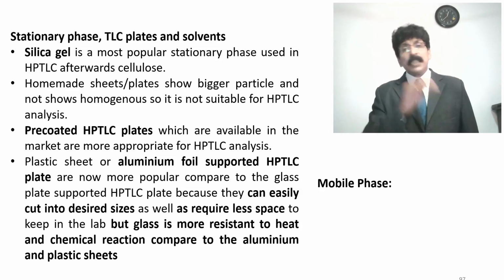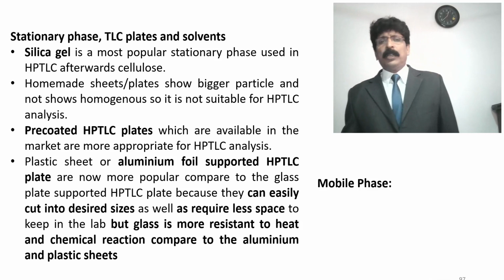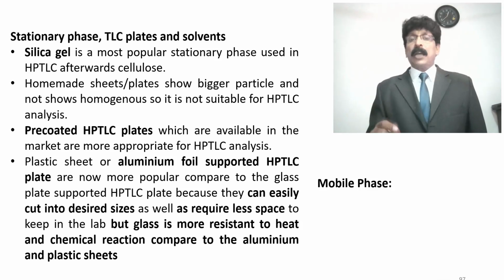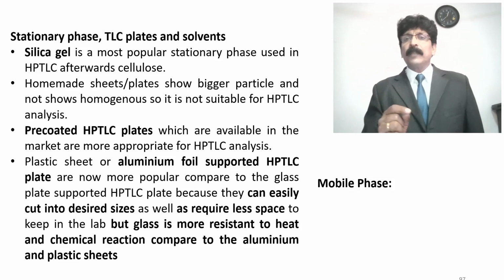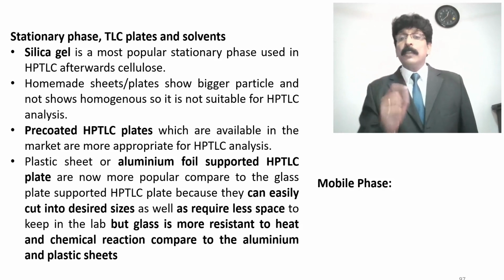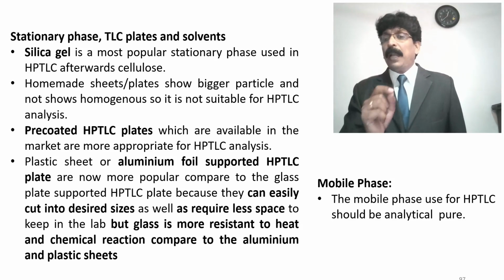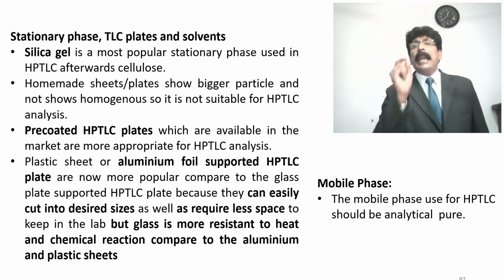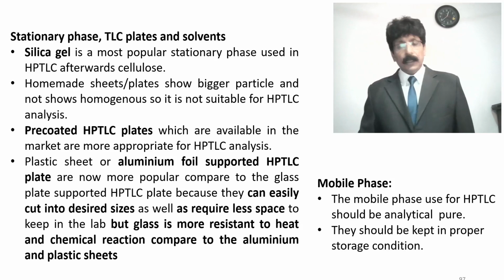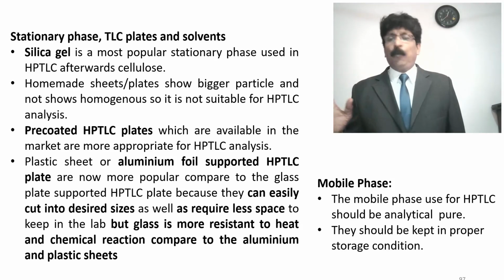Mobile phase selection is according to the substance, according to the chemical nature of the compound we have decided to separate. But the mobile phase or the solvent for HPTLC should be analytical grade, analytical pure. They should be kept in proper storage condition. Very, very important.